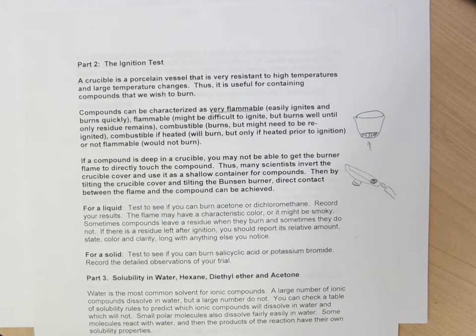you also want to put in what other observations you witness. So if the flame is pink, like for lithium nitrate, even if it's not burning, if you touch a flame to lithium nitrate, you're going to see sparks of pink color, which is a really important observation. If you have a lithium salt, you'll typically see this pink color when you expose it to flame. Flames might be very smoky. Some things leave a residue behind, byproducts of the combustion that do not evaporate, they're left behind.